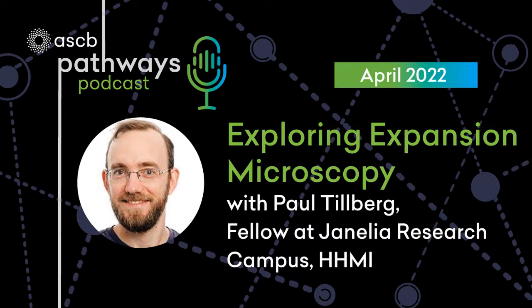So what are some interesting discoveries that you've seen either from your own work or from other people's work using expansion microscopy? So one example that comes to mind is from Josh Vaughn's group. He was a very early adopter of EXM, and they combined EXM with SIM, which is structured illumination microscopy. You get another 2-fold boost in resolution. So they used that to look at the cytoskeleton of Giardia parasite.